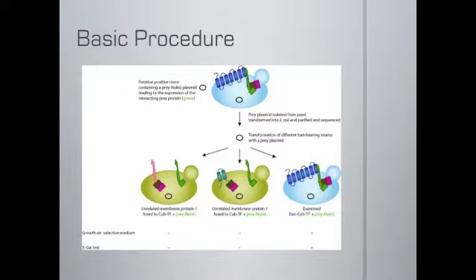In this diagram it shows this basic process where we've isolated this protein and then we transform it into bait-bearing strains with a prey plasmid. So we have these strains where in one, as you can see at the bottom right, it is our bait-bearing strain of our HspB2. That's our examined strain, the one that we know it interacts with. And then the two on the left that we see are unrelated membrane proteins.